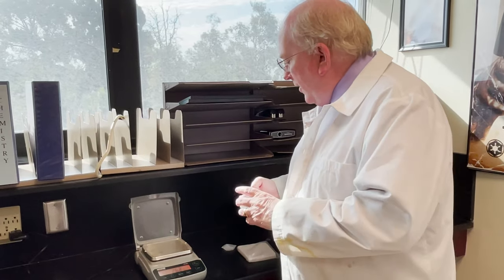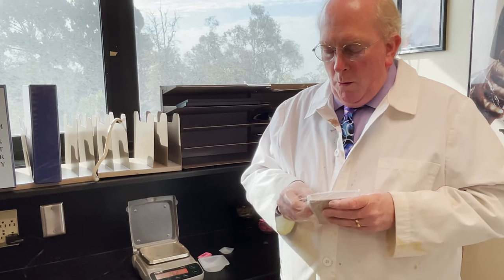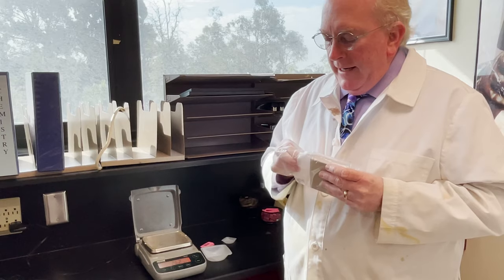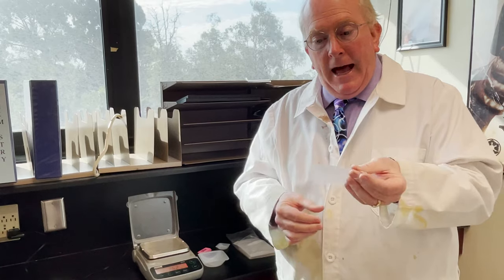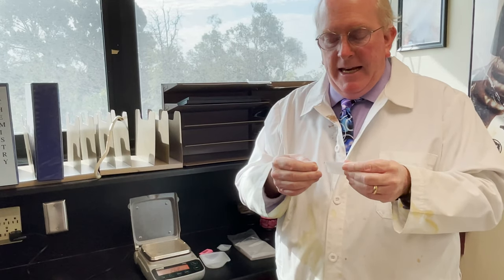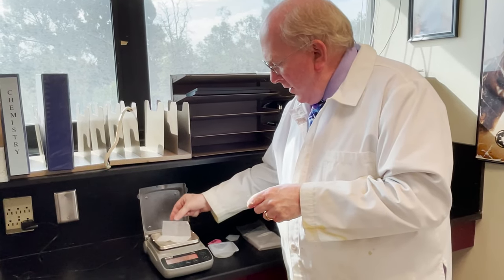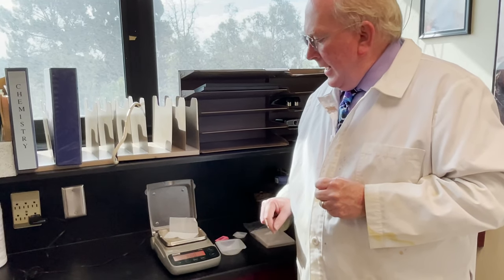Now, if you're not going to use one of the weighing dishes, we have what is called weighing paper. Weighing paper is very much like typical wax paper that you would find at home. It comes in a square sheet and what we do is we fold it in half and then fold it in half again. It does not need to be neat, don't worry. And now you have created your own little weighing boat. And you can zero that out.